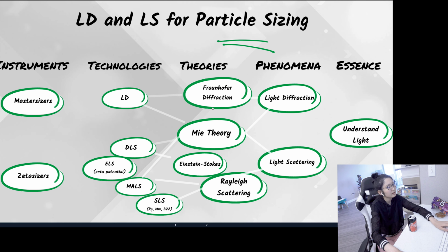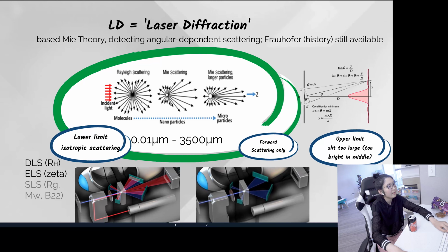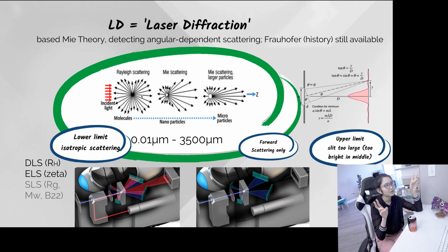And as I said, the technologies are based on the theories. It's how the theories apply to solve real life problems. And here, let's start with LD, meaning laser diffraction. Let's talk about the terminology laser diffraction.